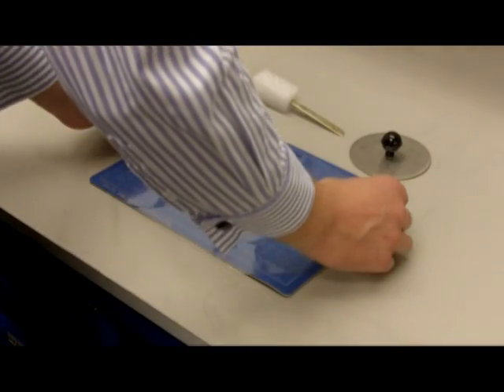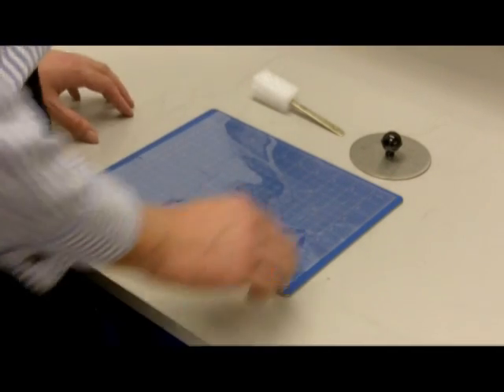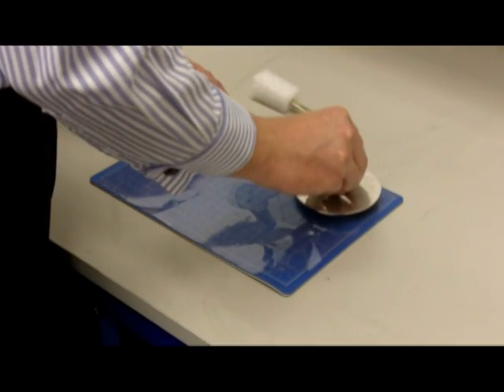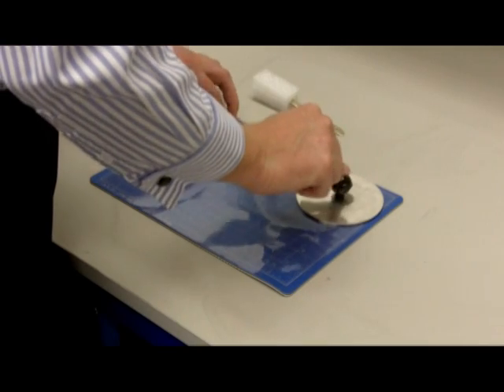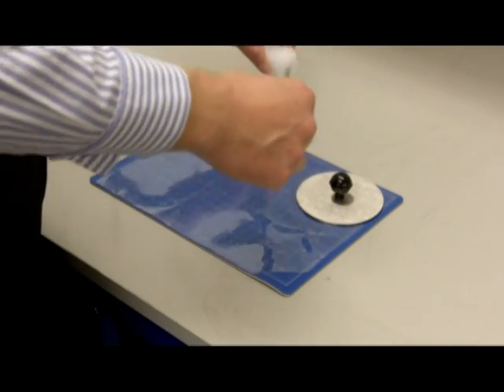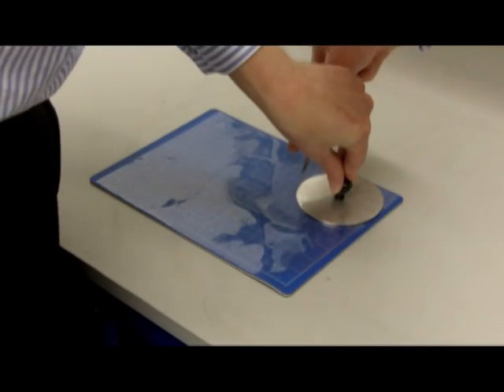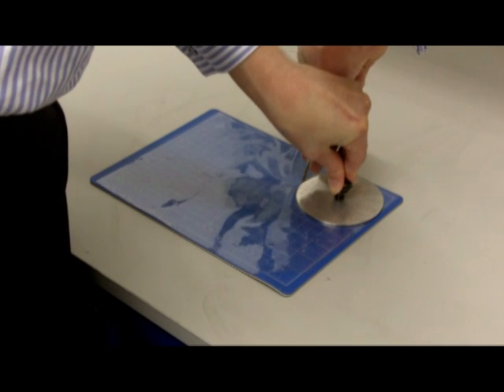Now let's look at cutting a film sample and starting a test. First choose the film you want to test and place it on a clean cutting surface. Using the template and scalpel, you cut out the film, leaving tabs either side for handling.